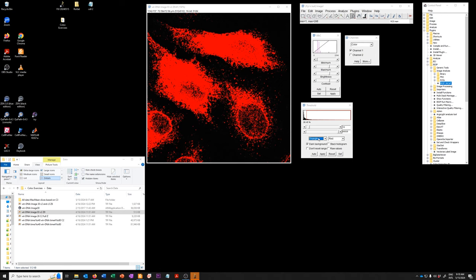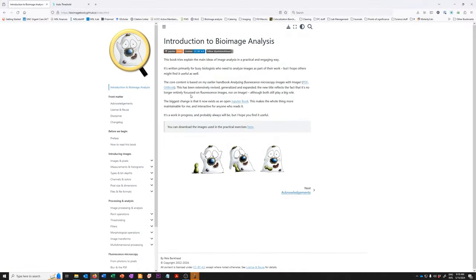If you're interested in using these automatic methods and you want further background on what exactly they are doing you can find that in two places. First this is a fantastic resource.